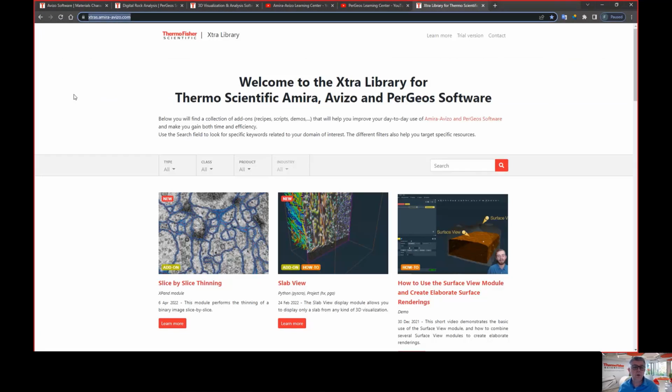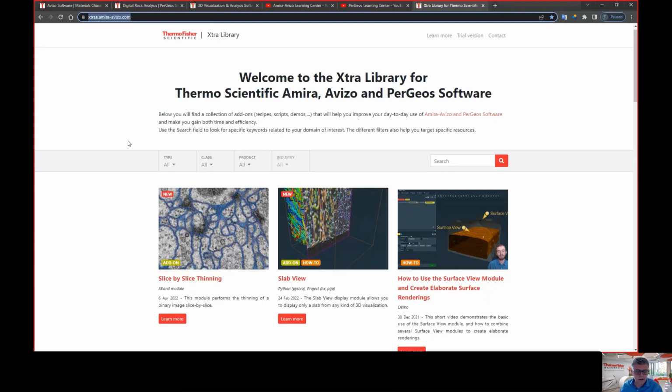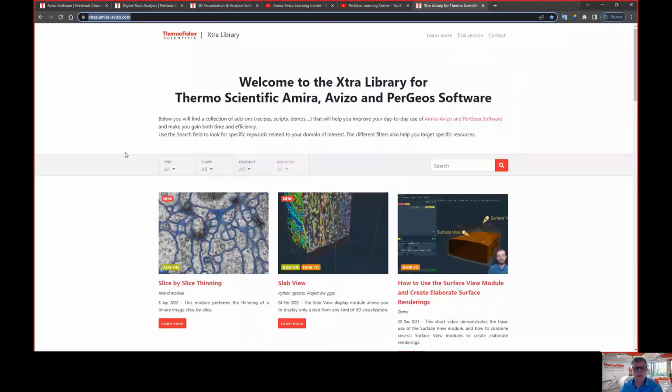We decided to create a portal where we can add add-ons to Avizo. Since Avizo, PerGeos, and Amira are extensible by anyone, we thought it could be a good idea to have resources online for free that you can grab and add to your own installation.